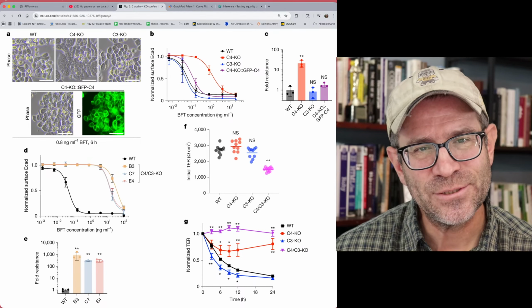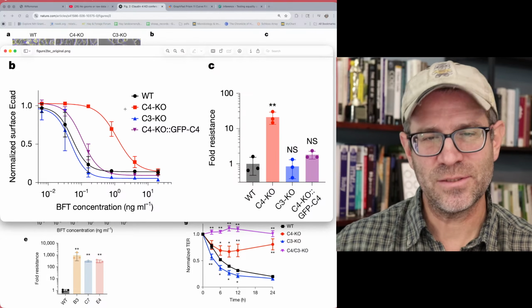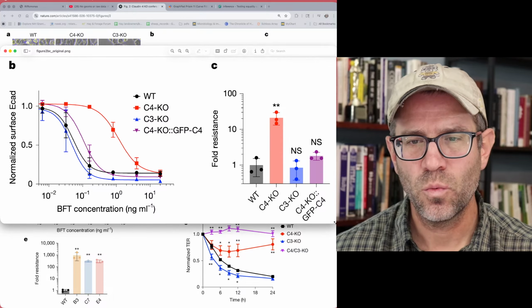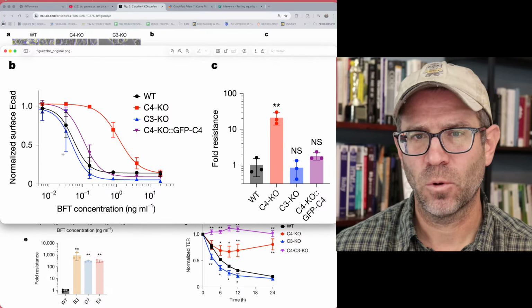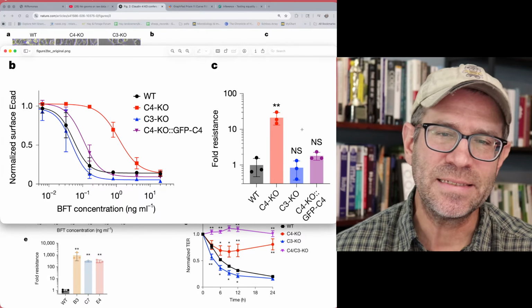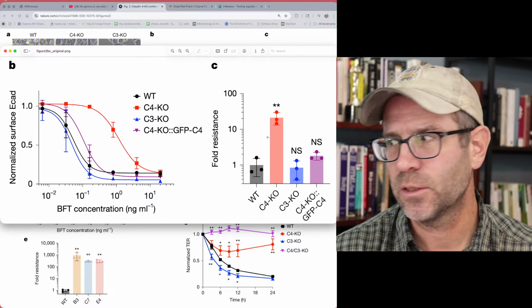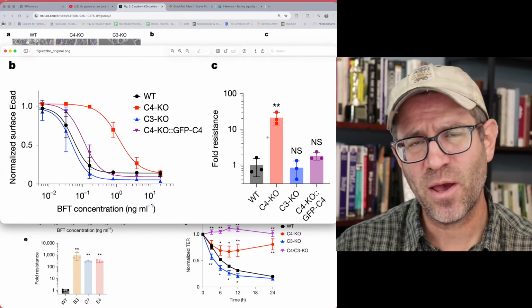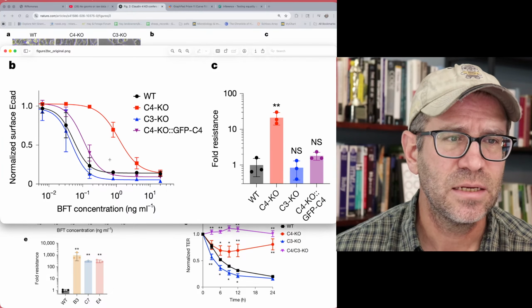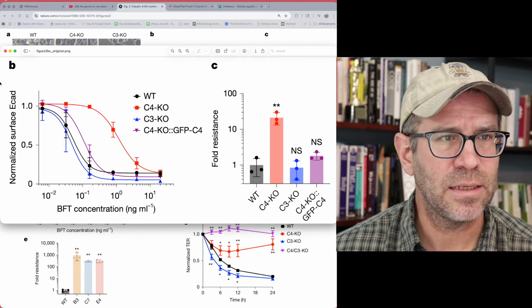So my plan is to initially recreate panel B, okay? And so let's do that first. We'll look at the data that's being plotted in panel C, and then we'll think about a couple different ways that we can draw those together, all right? So again, my plan on these videos is to typically go for about 2 hours. Got a little bit of a late start today, but total about 2 hours. So let's go ahead and get going with that.